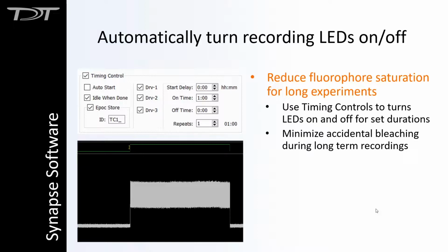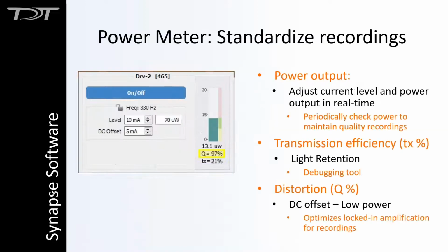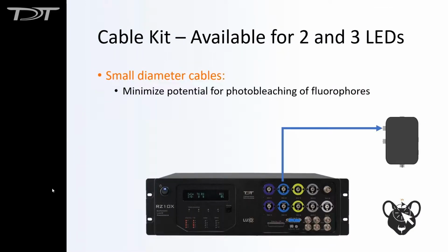And Sam Golden said, are there specific patch cables that need to be purchased for the system? Yes, and I actually do have a slide on that, which we will jump down to.